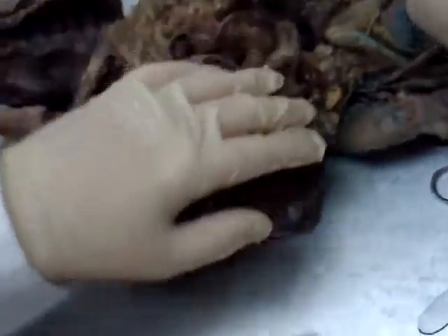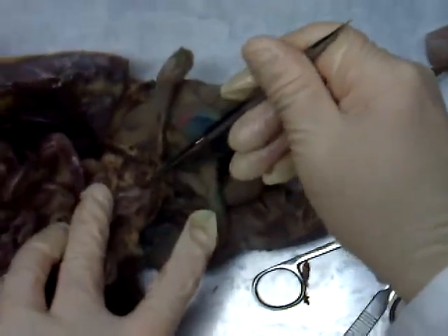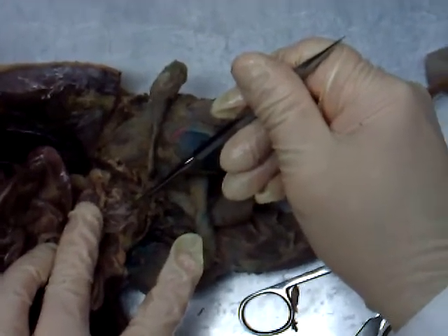As we saw today, you have a testis. This thing was the spermatic cord. Then down here, right below where the urinary bladder was — very nice on this mink — the big white thing right there is the prostate gland.